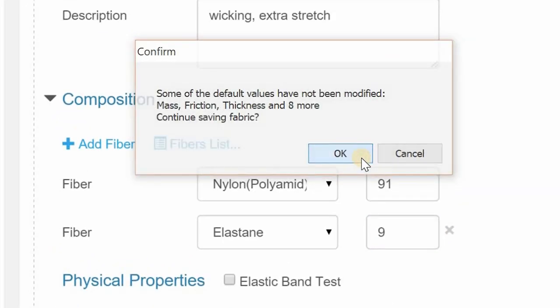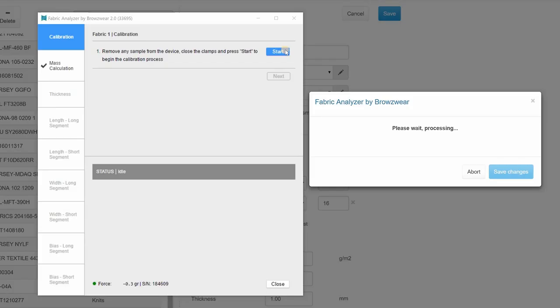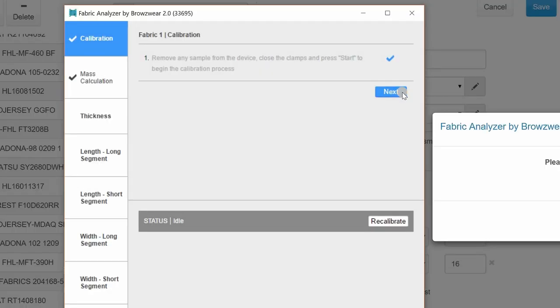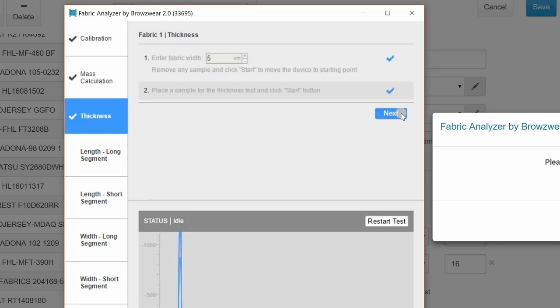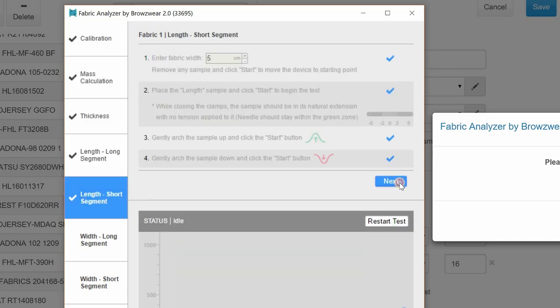Once the General Information and Composition sections are completed, you can begin FAB Calibration. Click the Use FAB button and a window will pop up to guide you through the steps you'll need to complete a test. Each time a test phase is successfully completed, the next test will be highlighted in the sequence.